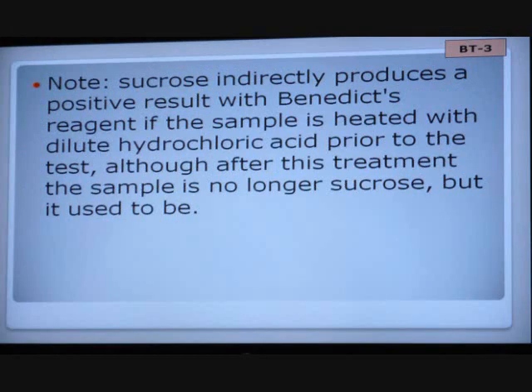Next slide. I already mentioned now, sucrose will react if you do something to it first. And that's what is not in your book. I knew you could find sucrose somehow, but I couldn't remember what you had to add to it. Now I found out it's a hydrochloric acid you add to it. A real weak version. You don't need strong acid. But it will destroy the sucrose. But in doing that, you make a product that the test can then find. So you knew it was sucrose, but you sure can't drink it.